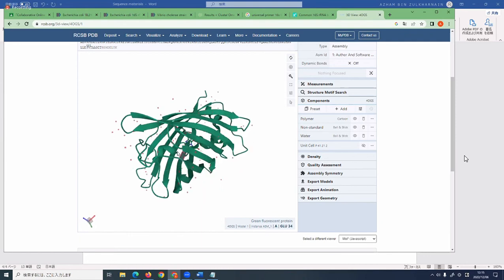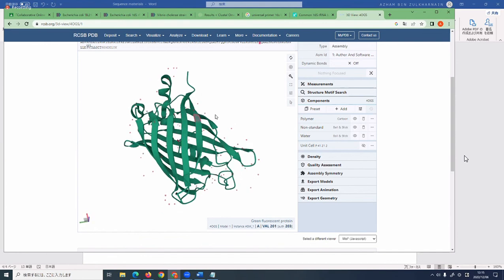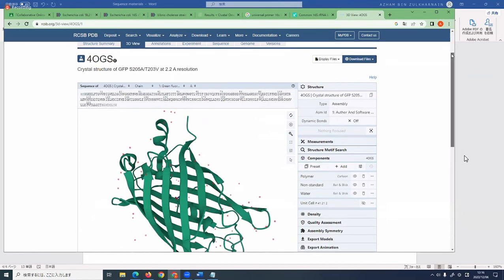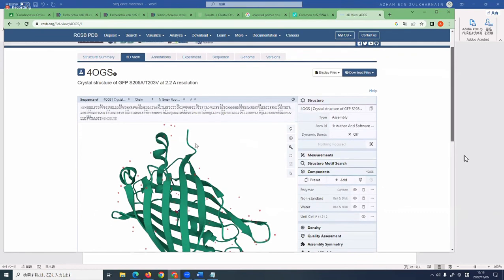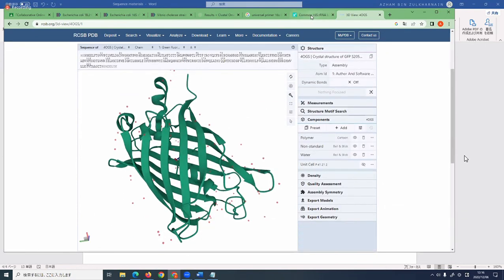There's something in the middle, right? So this is another bioinformatic tool that we use a lot to inspect different structures, so that we can sometimes categorize unknown proteins based on the structure, see the similarities, and try to find the basis of identifying unknown proteins.